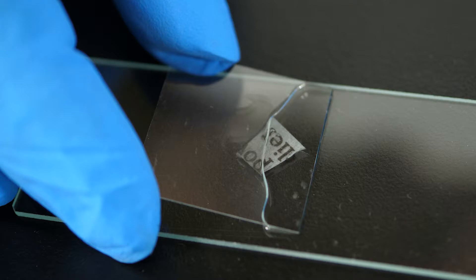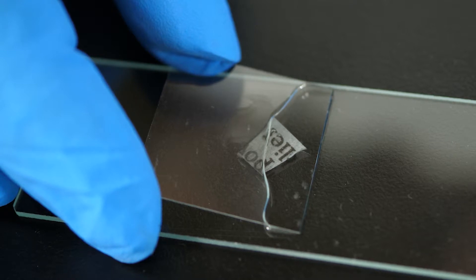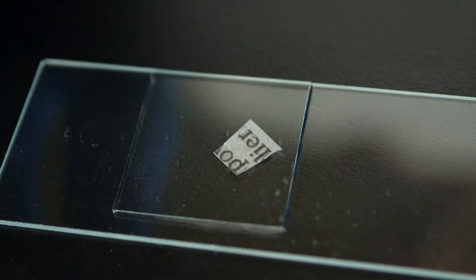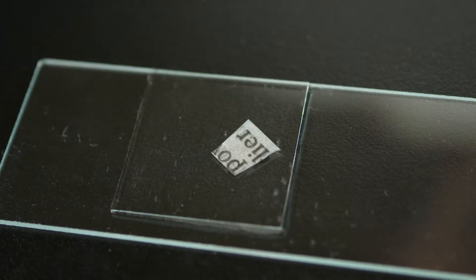To keep from transferring anything to the cover slip that might interfere with our view of the specimen, we grasp the cover slip by its side edges without touching the center. Now, we gently lower one edge of the cover slip onto the slide beside the drop of water. The object is to lower the cover slip into place without trapping any air bubbles. If bubbles do become trapped between the slide and the cover slip, lift up the cover slip and lower it again. If any water squeezes out when lowering the cover slip, use a paper towel to blot up the excess water.